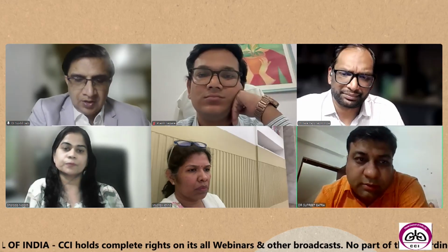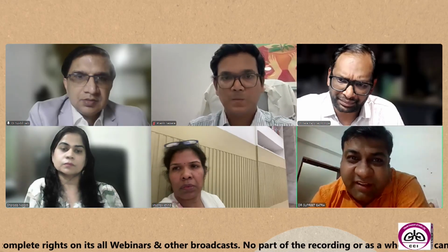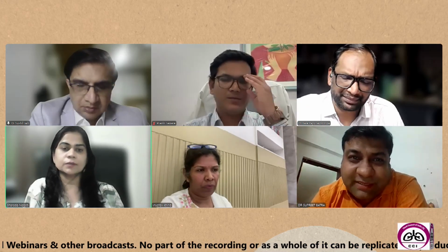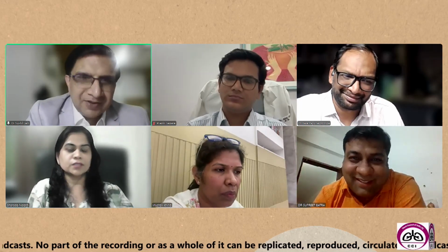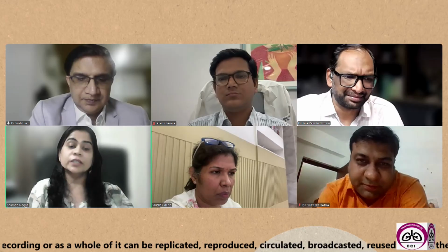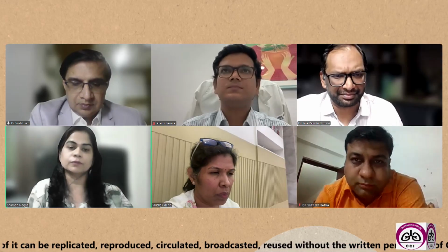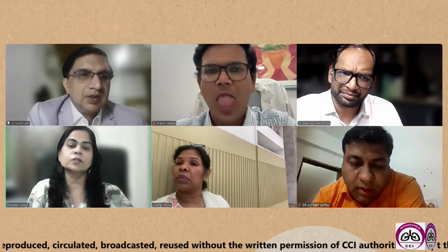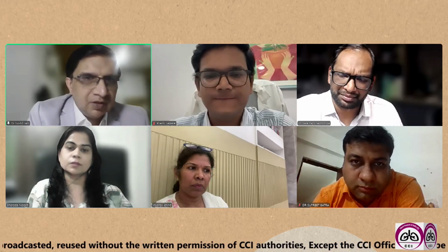Sir, one question. Yeah, please. Ma'am, do you do staining also on the sample? Because sometimes AFB staining can give you a positive diagnosis on your pathology samples. Sometimes it has happened, my microbiologist is not able to find the AFB, but the pathologist has found it on the sample. Yes, there are a lot of situations like that. We definitely do. When there is necrosis, when there is granuloma, even if the granulomas are well formed, definitely we do a ZN stain for AFB. Thank you. My next question, do you also do fungal stains? Okay. We also do fungal stains, especially in immunocompromised patients, sometimes you get fungal infections there.